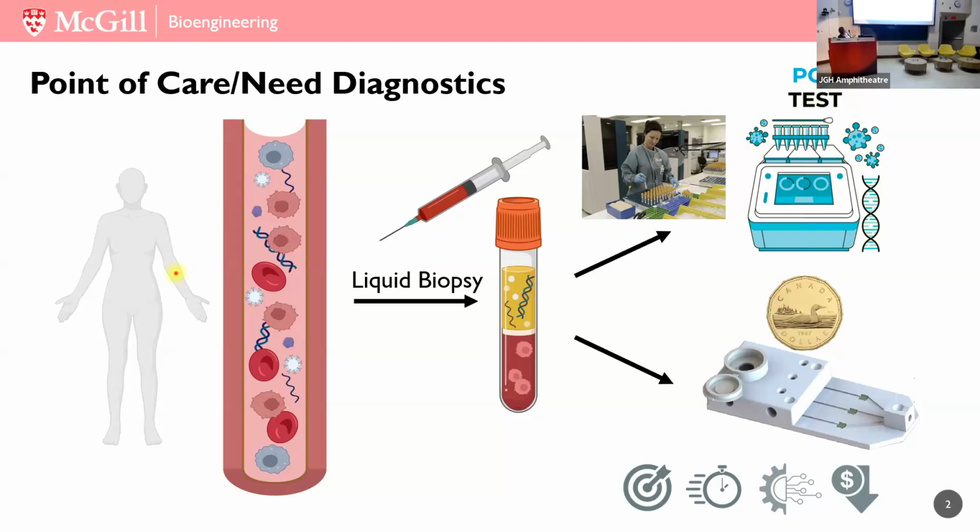These biomarkers can vary from vesicles to nucleic-based biomarkers. We had a great talk on ctDNAs. They can be RNA-based, protein-based. But in particular, what I'm going to talk about today is one particular technology that we developed to tackle extracellular vesicles at the single level.